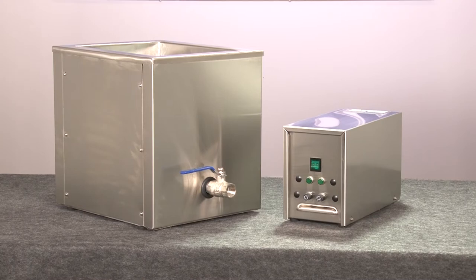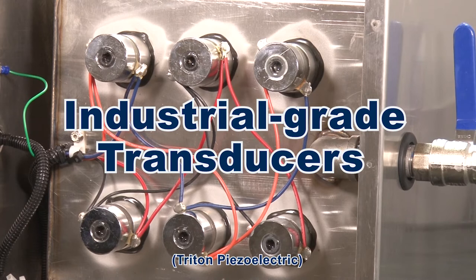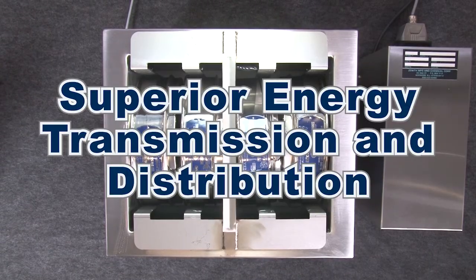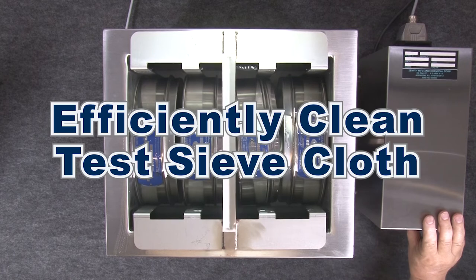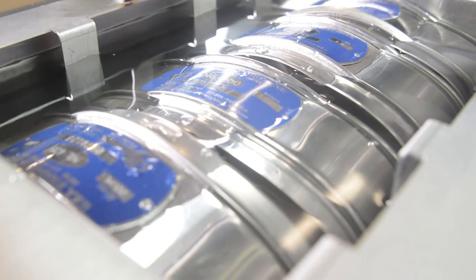This tabletop cleaner uses industrial-grade transducers, which are bonded to the unit using the latest metallurgic and epoxy technologies to provide superior energy transmission and distribution within the cleaning tank, to efficiently and quickly clean the test sieve cloth, including fragile precision electroform mesh.